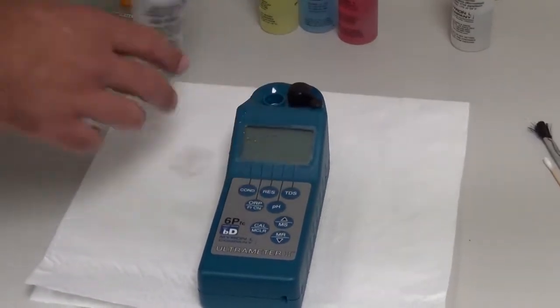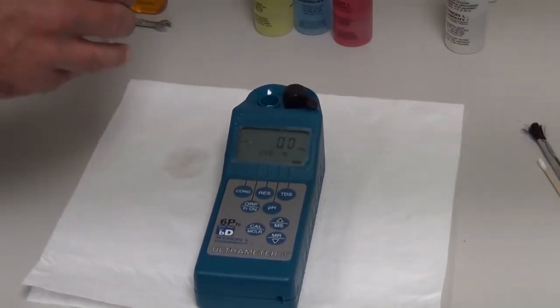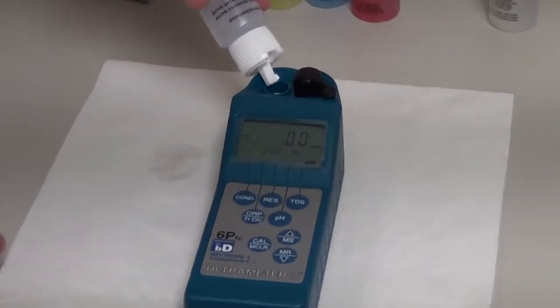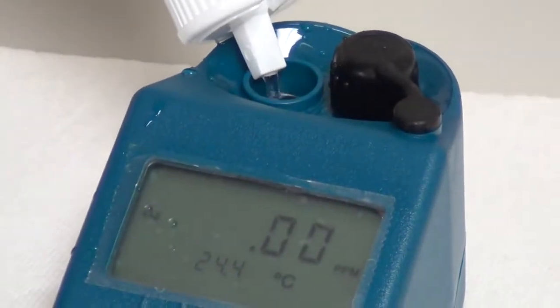So I'm going to fill my cell cup up three times, making sure that I fill the cell cup all the way, covering the temperature thermistor.